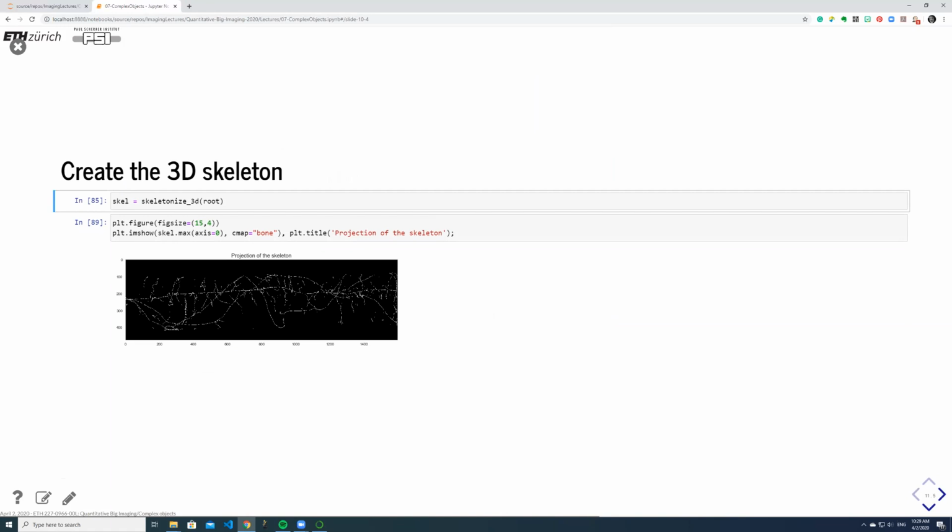If you want to play with it, and actually you will play with it in the exercises, the data is already uploaded on GitHub. It was so big that I needed to compress it, so you have to uncompress the data when you start doing the exercise. But this is what the skeleton looks like in the projection with the screen resolution I have right now.